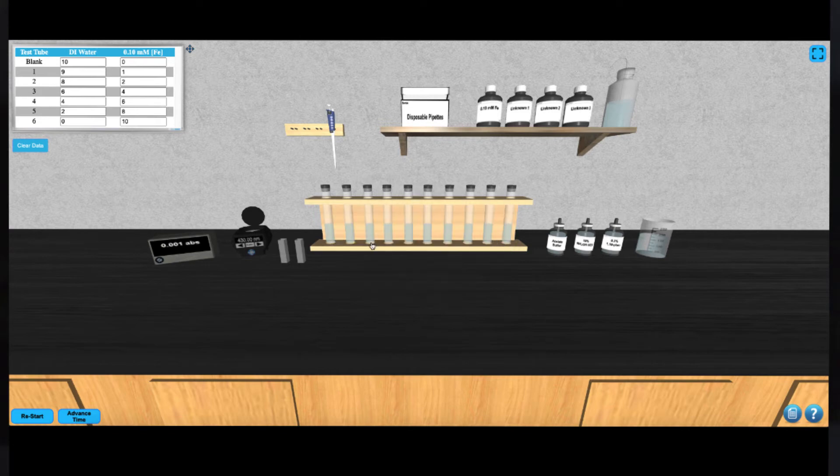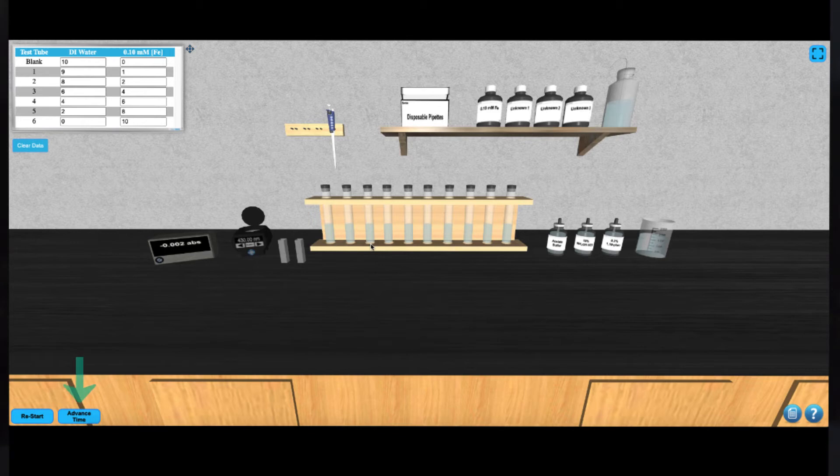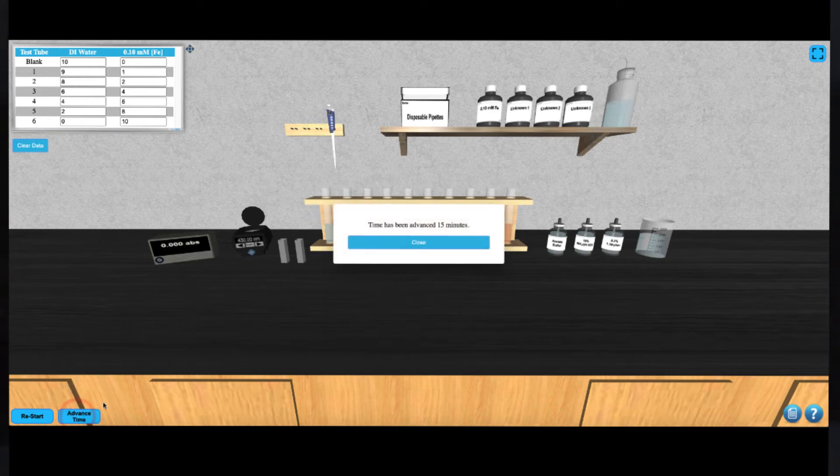With all of this finished, you can artificially advance time by 15 minutes by clicking on the advance time button on the bottom left of your screen. This will allow the reactions to complete.